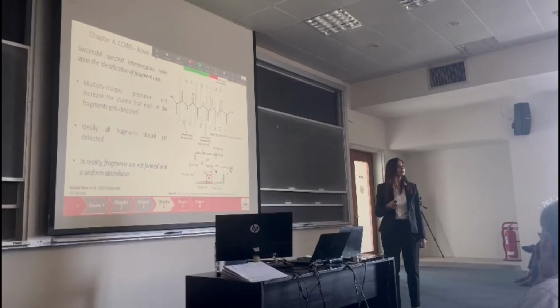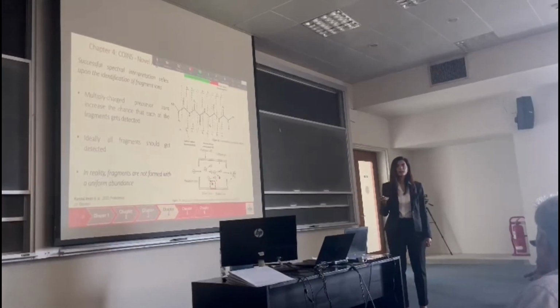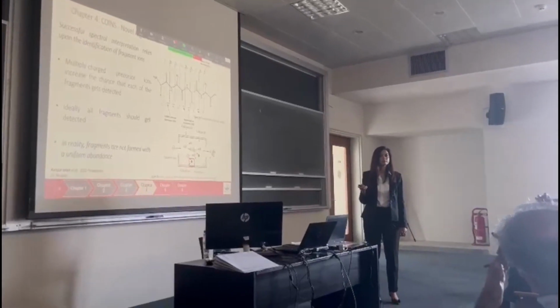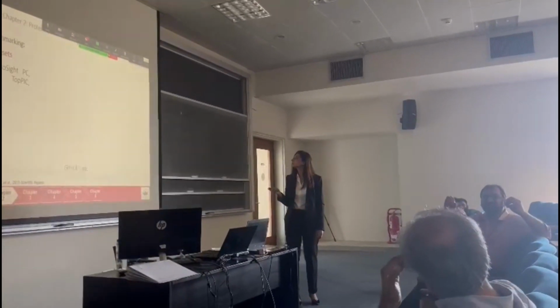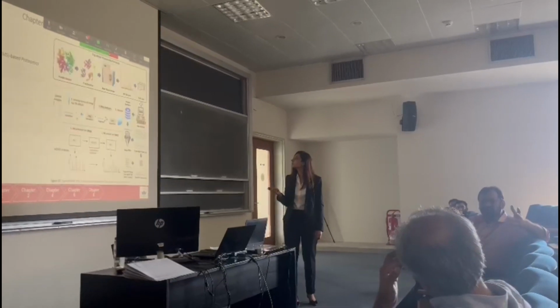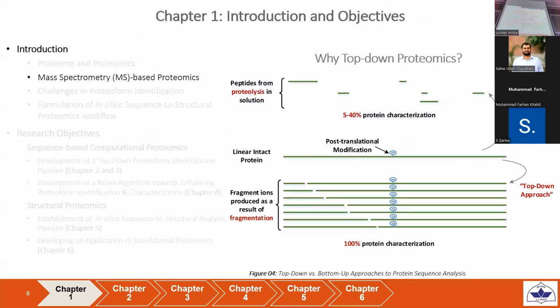With every collision, each peptide or protein gets one cut, and that is random. So there are not multiple cuts on the same molecule. I'll show one diagram, with 2 fragments. It's like a rubber band: you stretch it and cut it, and the strings collapse, so you just get 2 portions out of a protein.